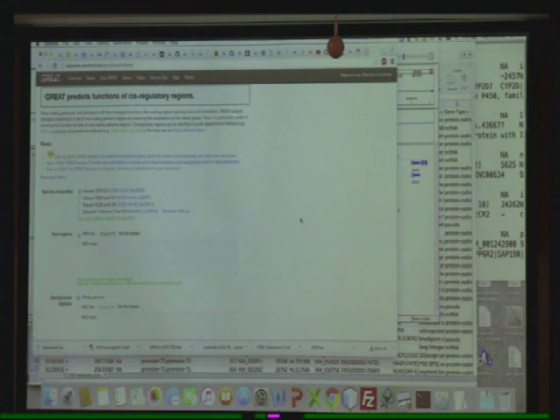So this file is actually just your summits file, just the chromosomes start and stop. So it's just like a bed file that lists where your peak locations are. It doesn't include the extra column or two that says the peak ID and the kind of score. So I just took out those two columns, and then you're only uploading the coordinates.